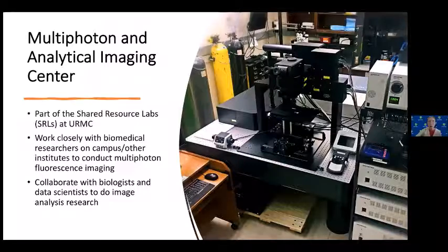For today's talk, I will mainly focus on two projects we have been working on in the lab, where we saw difficulties when conducting imaging using fluorescence microscopy. So we look for methods that have been fully developed in other fields, that are easy and simple to use, and try to apply them to bioimages. We want it to be easy to use, but in a robust way.